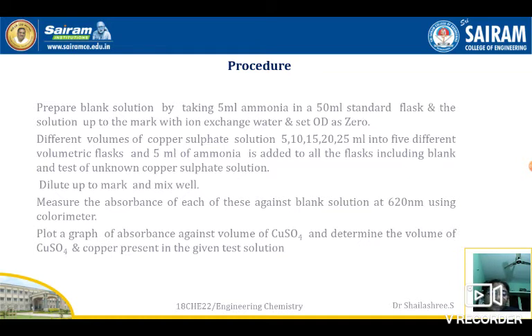And after setting the OD to 0, you just have to measure the absorbance for the other solutions. That is, you are measuring for 5, 10, 15, 20, 25 and at last for the test solution. Clear, no? First you have to take the blank solution, set the OD to 0 and then measure the OD for all the other solutions. And after measuring the values, you have to plot the graph.